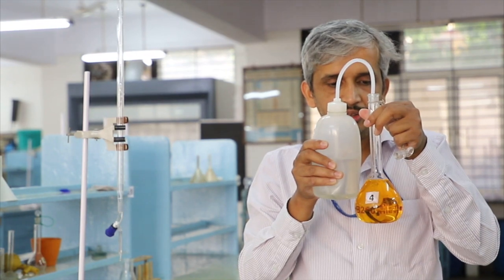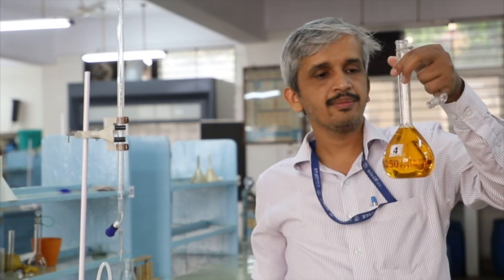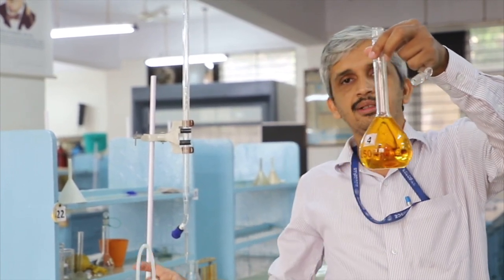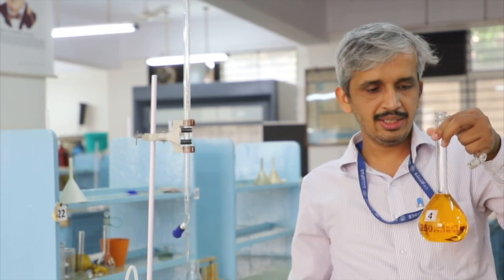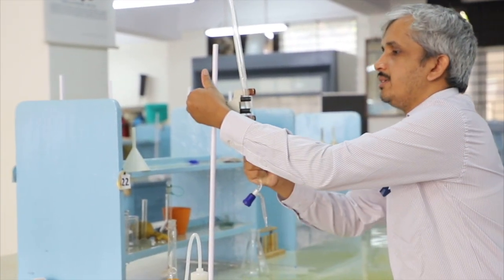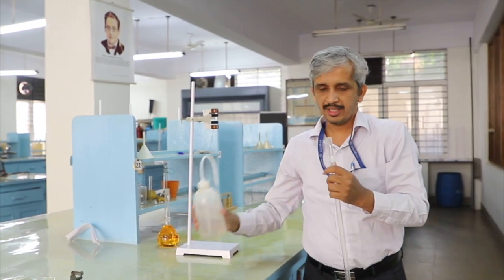So in order to avoid that, I will stop at this point. Now I can comfortably fill up to this point using the wash bottle. Later, I don't have proper control with the wash bottle. Therefore, what I will do is, in a clean, washed and rinsed buret, I am going to take distilled water.